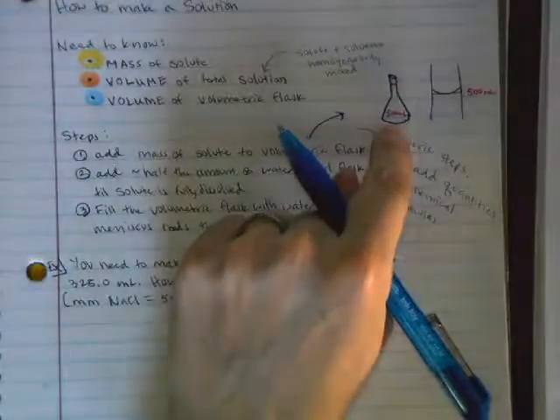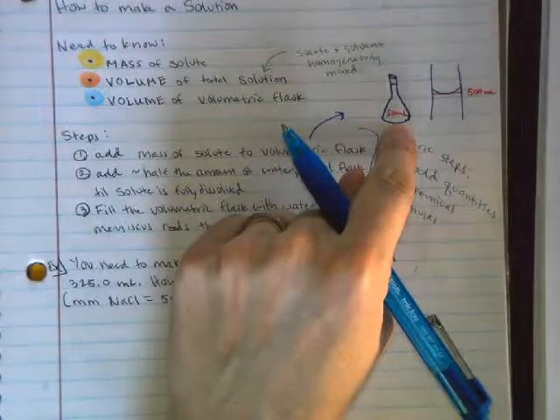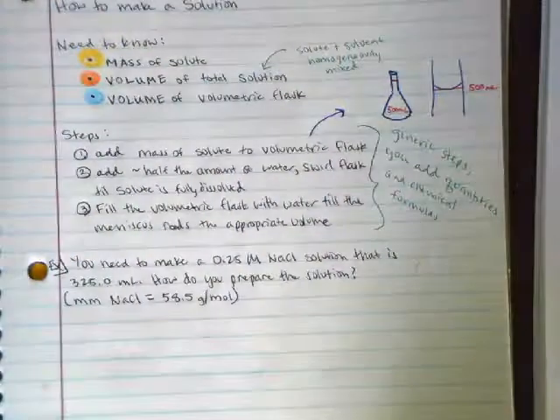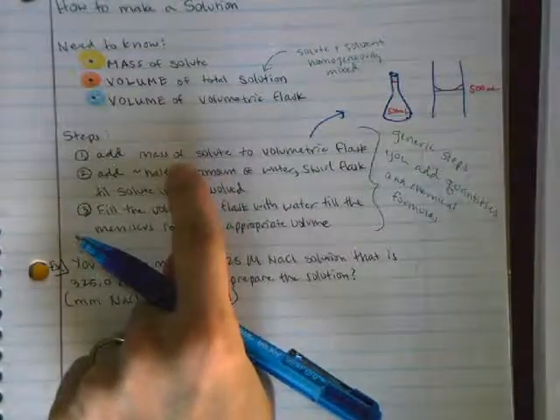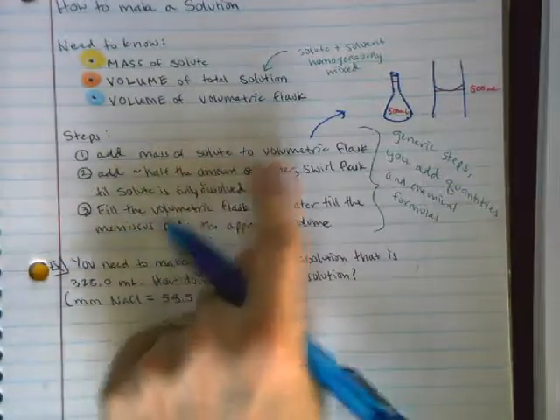These flasks are not good for measuring various quantities of solutions, but if I need a 500 milliliter solution, I'm going to use this. This is exactly what I want. Okay, and they come in various sizes, obviously. So if I am able to calculate the mass of the solute, which we went over in our last lesson, that I need to make a solution, I'm going to add that mass of the solute to the volumetric flask.